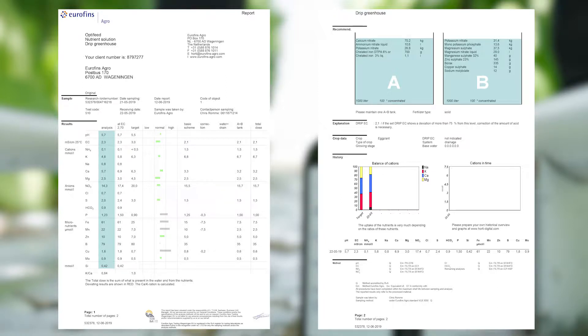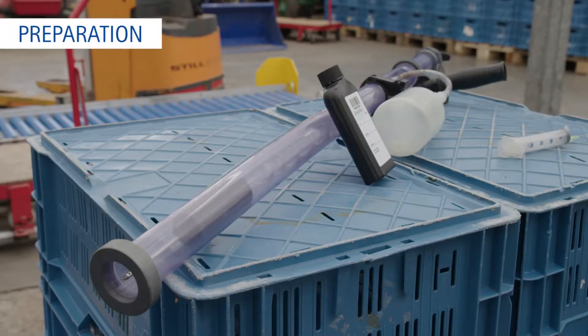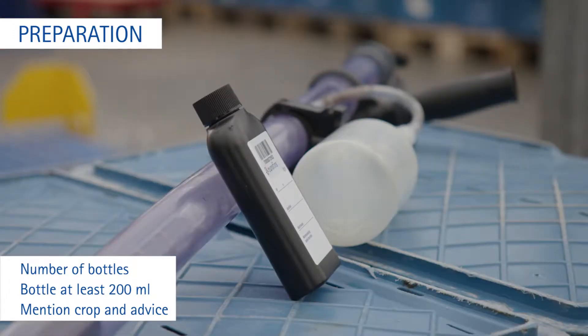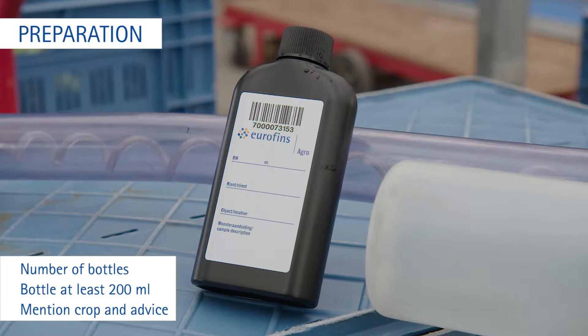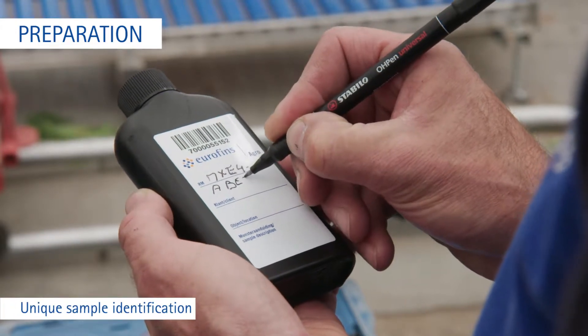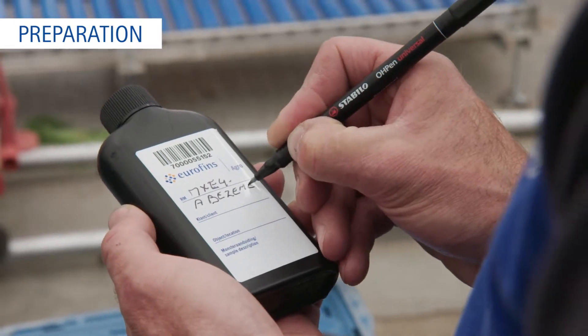Advice on crop-specific recipes is also an option. When taking a water sample, please take the following steps into account. Consider how many samples you need and prepare the correct number of bottles. Use bottles of at least 200ml per sample, both for water and for nutrient solutions. Preferably, use Eurofins Agro's Special Black Bottles. Write your unique sample identification on the label, and mention the crop and the code of the analysis and advice you want to receive.